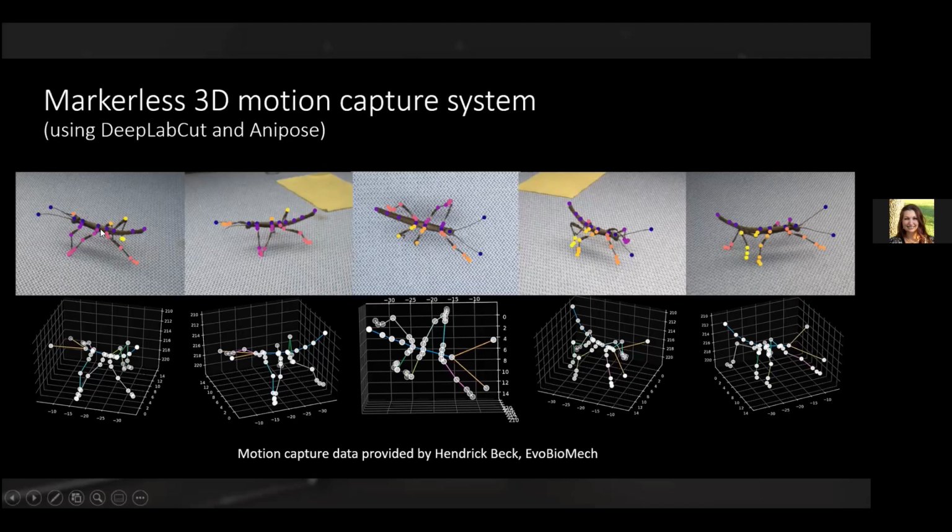So here we have all of these wonderful 2D pose estimations after producing lots of training data that the system can now relatively robustly identify, at least as long as everything happens on that confined walking platform. And now, using AniPose, we can first synchronize all these cameras and then calibrate those cameras. So we also have an idea where these points are actually located in 3D space. And by then projecting the underlying skeleton that we have defined back on these points, we can see how this would then shape out to be.